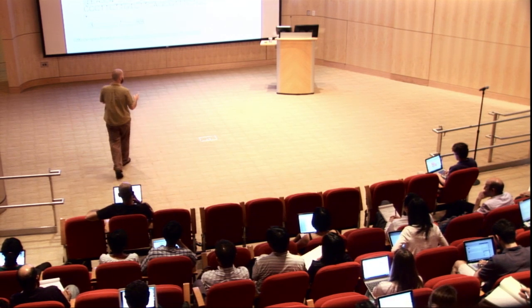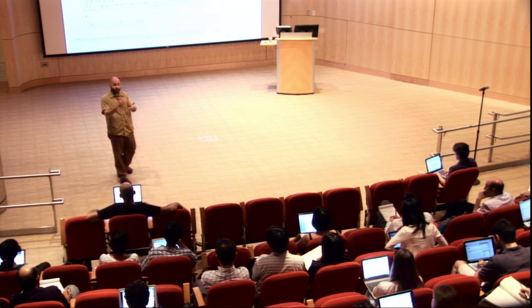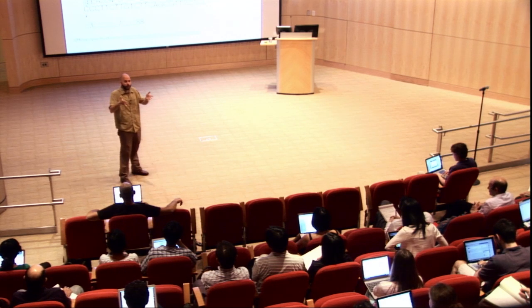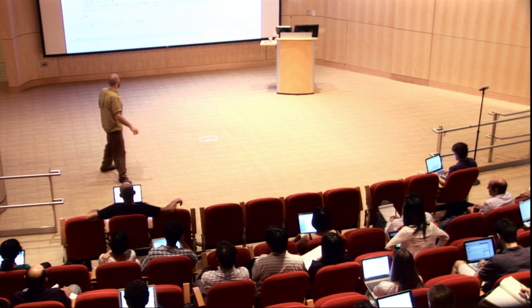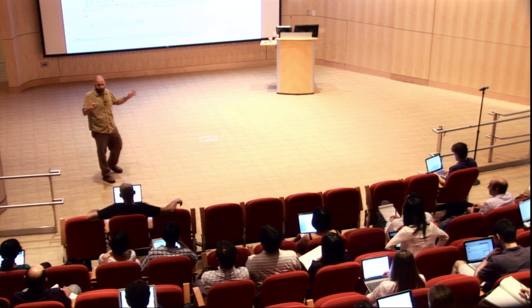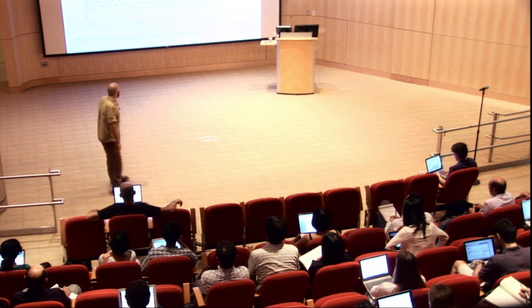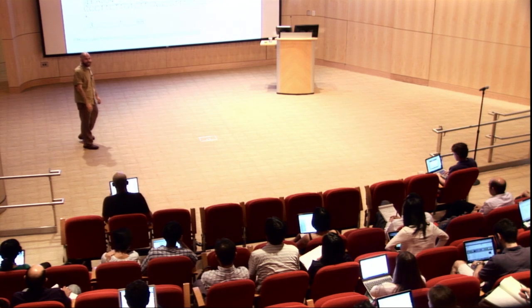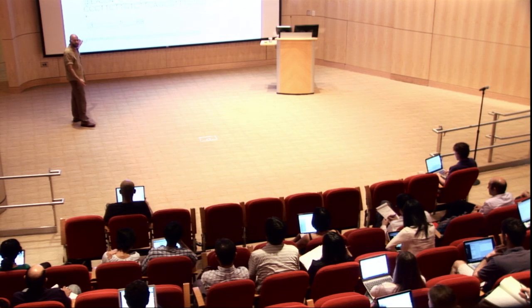It's not so important because a Phred scale of 90-something is crazy, right? That translates into a probability that's astronomically high, right? So you would never have that much confidence in a base, and if someone said they had that much confidence, you shouldn't believe them, right? I'll explain why it's crazy in a minute, but you'll see that a Q score of like Q90 would be very, very confident, right? And no one is that confident. They shouldn't be. Does that make sense?